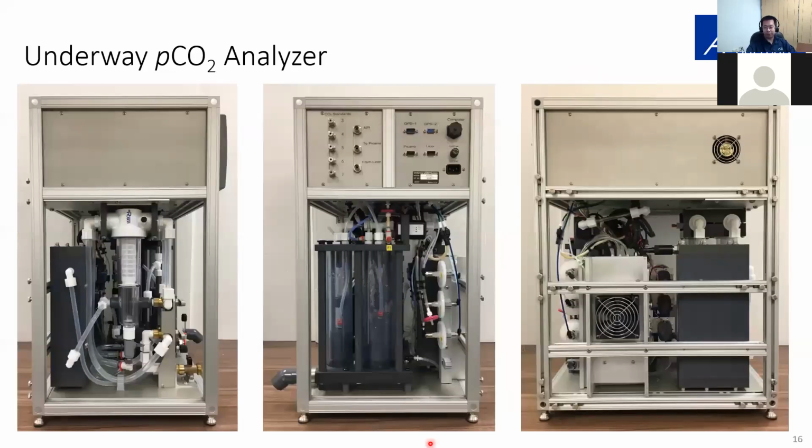Here are just more pictures from different angles to show you the components. This is SBE45, the thermosalinograph. Water filters, there are two, one behind this one. The equilibrators, air filters, and the cooling module.